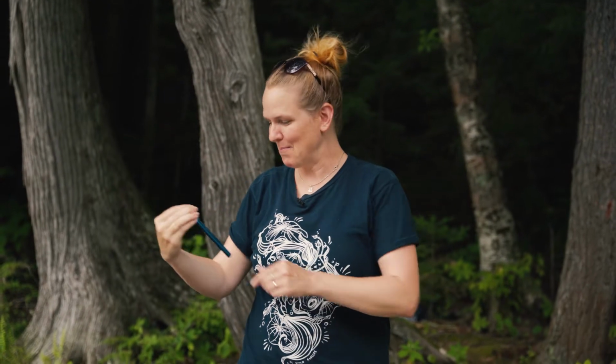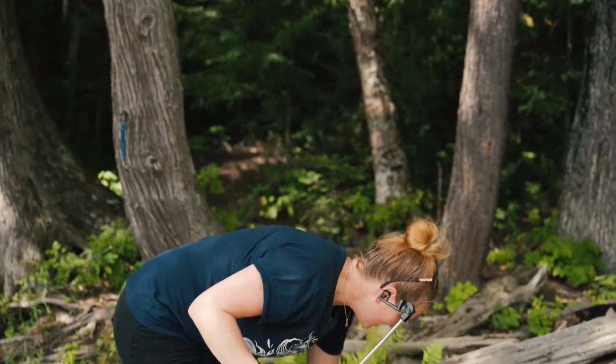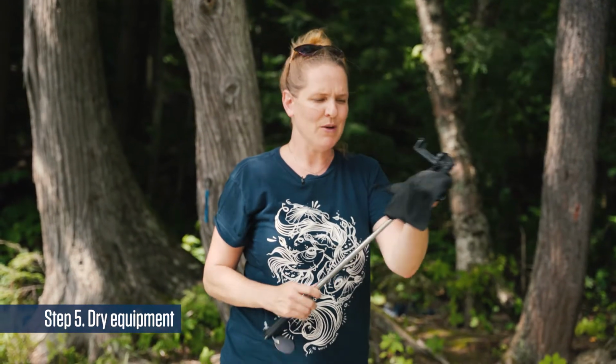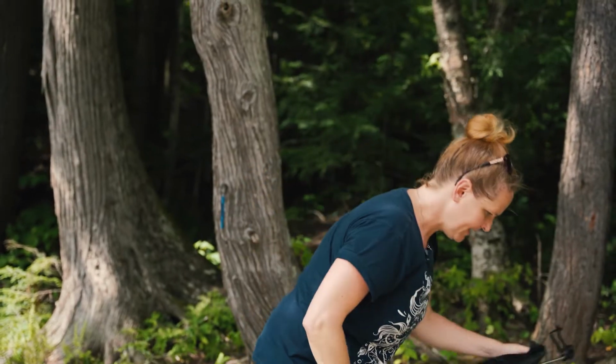So our last thing is to note our air temperature, which is 30 degrees Celsius, and pack up our kit. Once you're all done, you're going to pack up your kit. We include a towel so that you can dry off your equipment. We just really want you to preserve the longevity of your equipment.